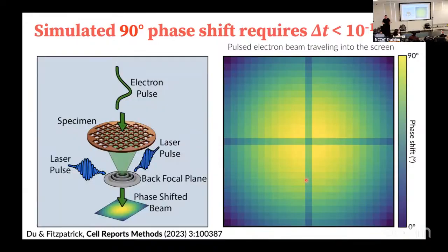So when it comes down and hits the photon, there's no change in momentum of the electron? Right. It's a completely elastic effect, so you do not have any transfer of energy. You could have an energy transfer, but you want it to be completely elastic. This whole effect is called the ponderomotive effect. You could have an elastic ponderomotive effect, or an inelastic one. The reason you want it to be elastic is you don't want to change the other behavior of the beam. You don't want to change the energy of the beam. You want to simply change the phase of the beam in this moment.